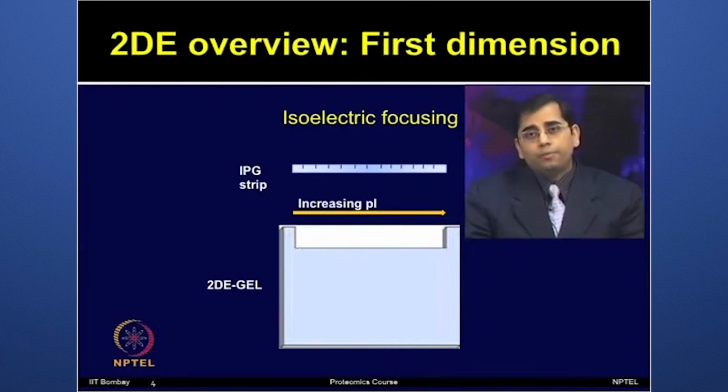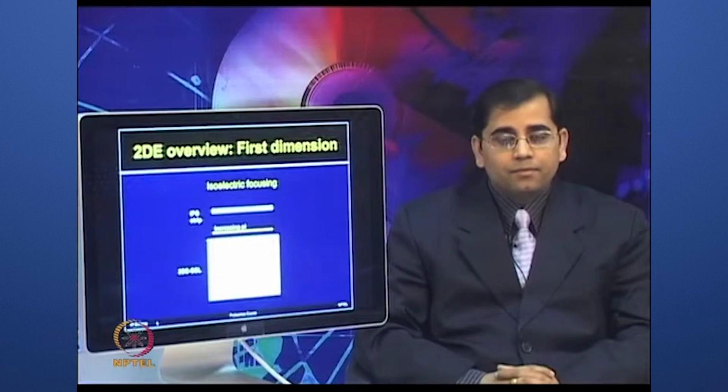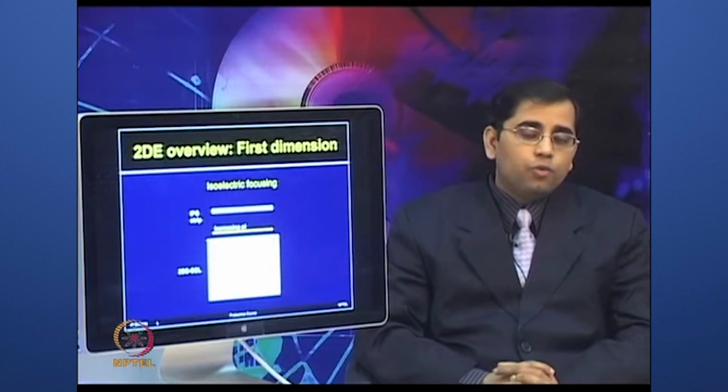Ideally, you want to separate as many proteins as possible, which means you want very high coverage of the whole proteome. Considering the diversity of samples one can apply to these techniques, it becomes very important to first standardize a very good protein extraction.